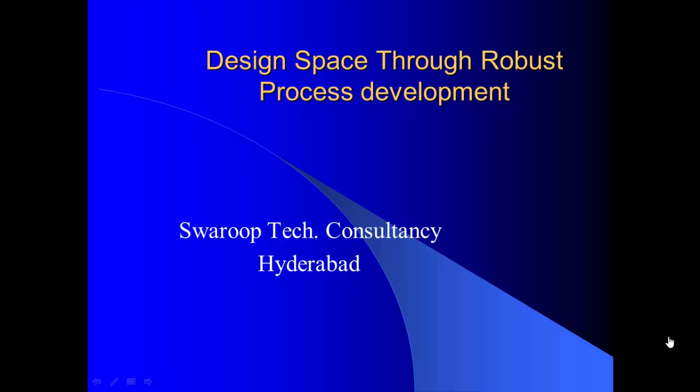In addition, the parameters for a robust process, which resulted in 57% yield, were also found using simulation and graphical methods with the help of SigmaTech software. We are now going to showcase the SigmaTech software using this real-life example.